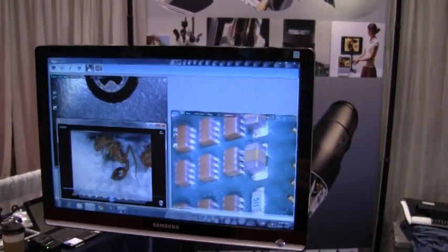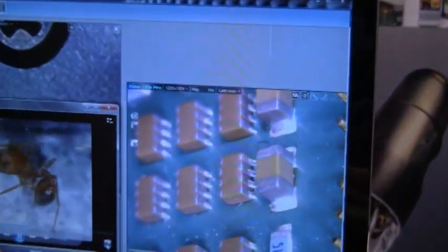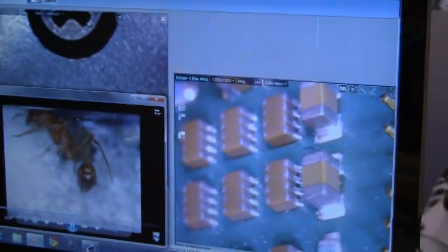So with this I can capture pictures, I can also take videos, and I can do some measurements on my images too, if you wanted to take dimensions.